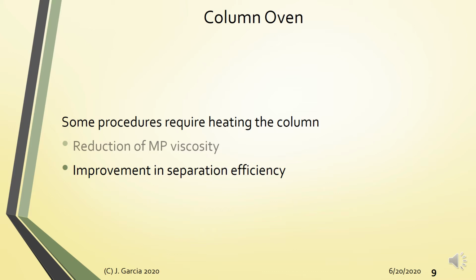Okay, as we all know, the manner by which your components separate is dictated by an equilibrium, no, yung distribution equilibria. And just like any equilibria that you encountered in chemistry, temperature plays an important role in this equilibria. So there are protocols, no, that require you to have a thermostated environment. So isothermal lang ang ginagawa ng oven. Usually up to 40 degrees centigrade lang yung column temperature setting, if you are to use a column oven.